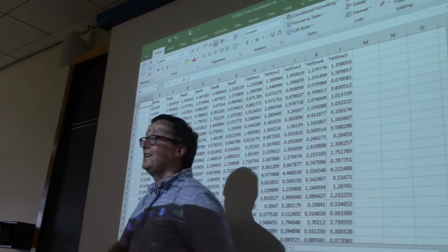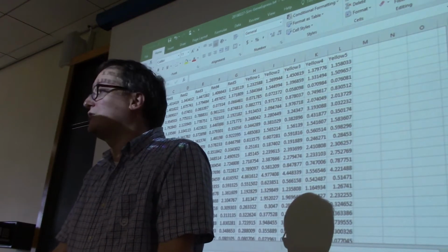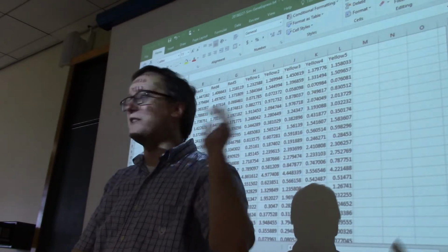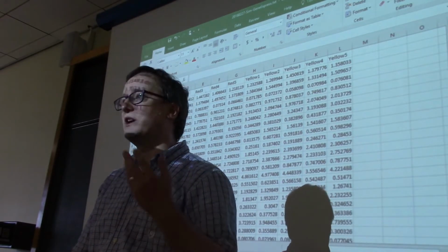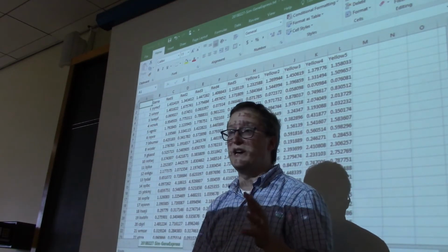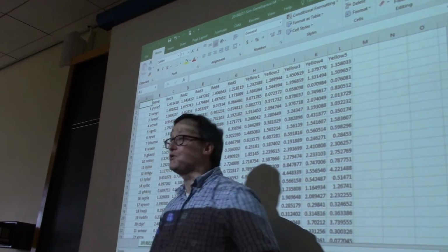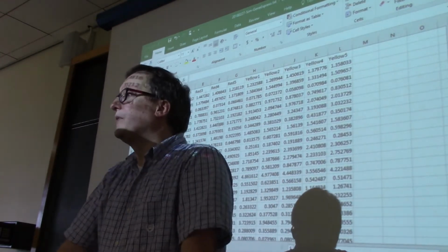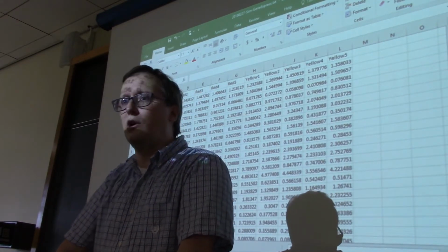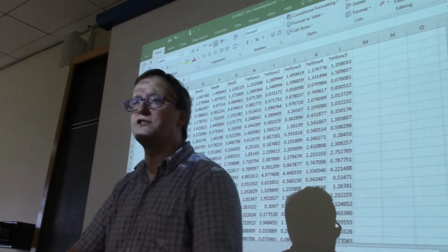The second column is labeled gene. So we needed to have some sort of label to attach to each of these expression values. Normally those would be gene names like SARC or RAS or whatever, just the set of gene names that we're accustomed to from human gene names. But in this case, I decided to go with randomized gene names. So each of these is 5 characters long, and they're just random series of letters. So, quick question. If I have gene names that are 1 character long, how many different possible gene names are there? One letter long, I should say.